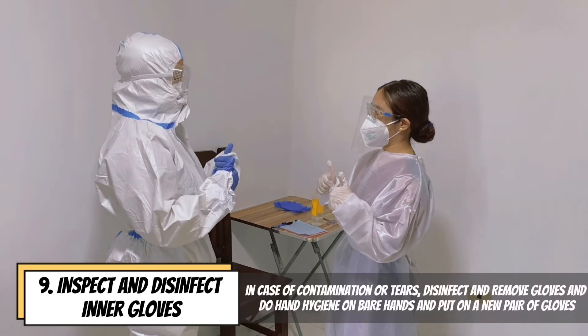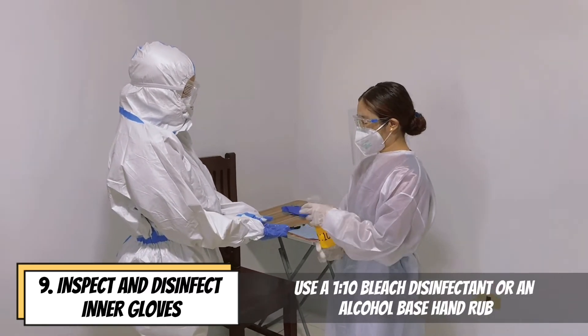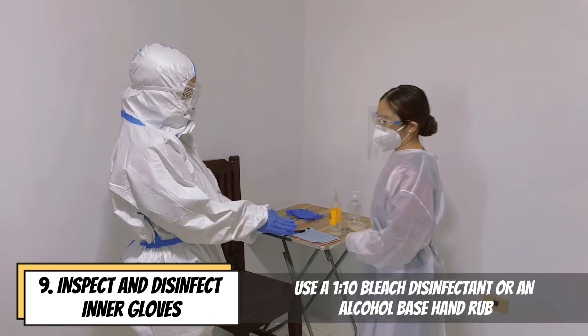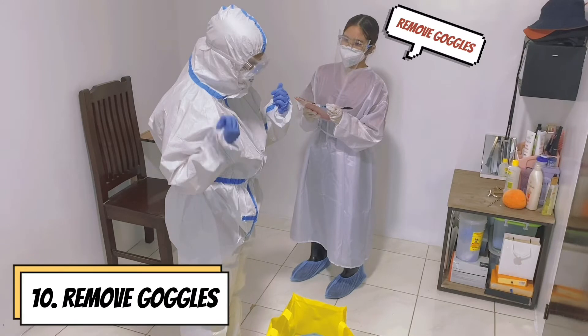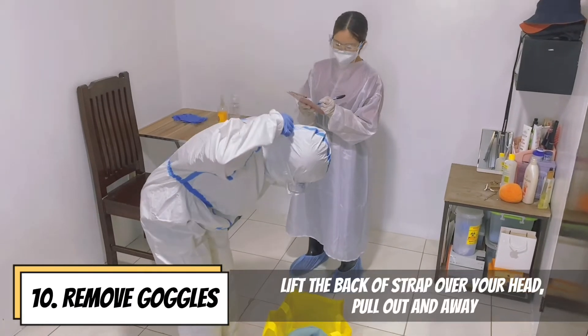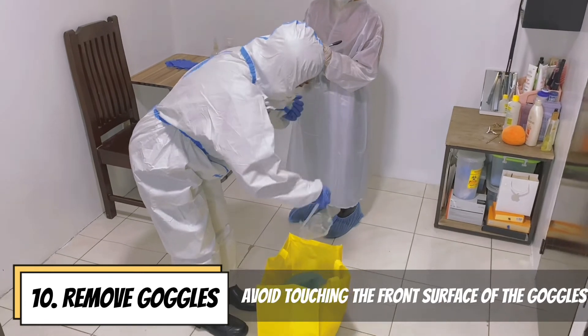In case of contamination or tears, disinfect and remove the gloves, do hand hygiene, and put on a new pair of gloves using a 1-to-10 bleach disinfectant or an alcohol-based hand rub. Remove goggles by lifting the back of the strap over your head, pulling out and away. Avoid touching the front surface of the goggles.